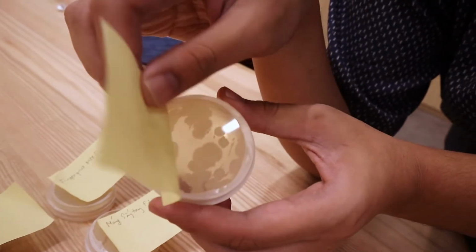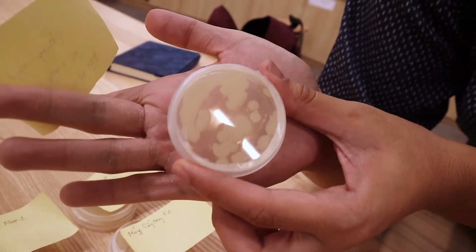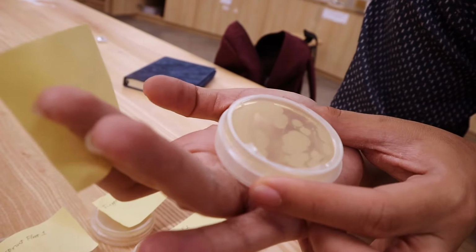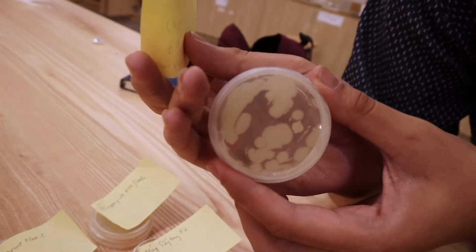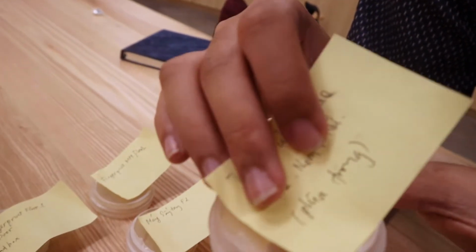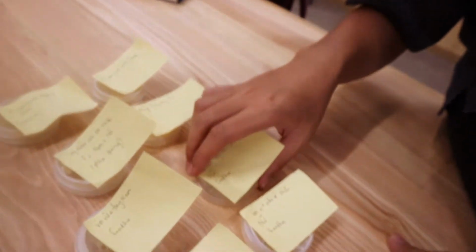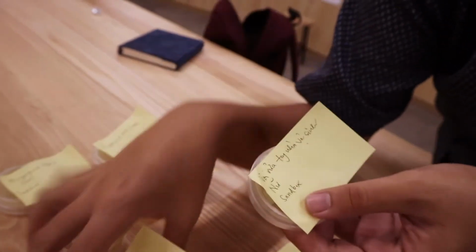Excited. Yeah. It's also bad, but it's less bad than the blow dryer. Still really cloudy, like 50% cloudy. All with E. coli, which is a relatively friendly strain of bacteria, but you do not want it to float and run free everywhere. Okay, we come to this pair.